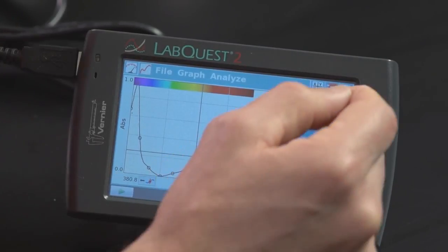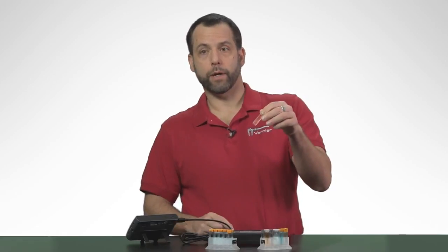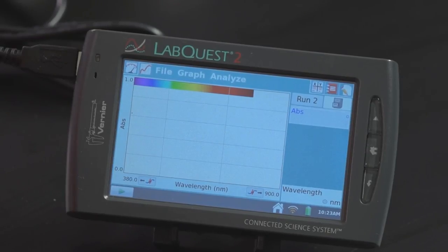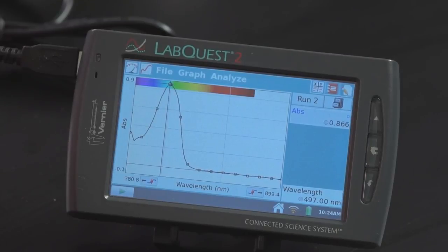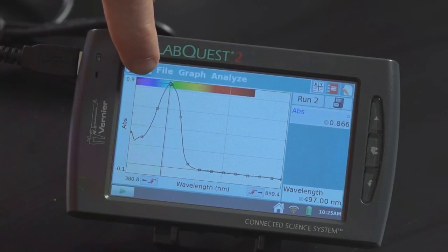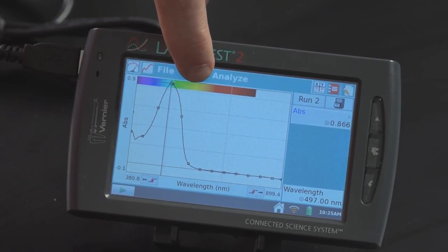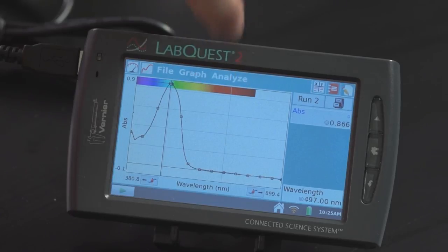If I wanted to store this run, I could just hit this little store button right here, and then I could look at red food coloring. Red food coloring is probably going to absorb mostly in the green. You can see it absorbs a little bit in the blue, then it increases as we get into the green, and then it begins to decrease across the green, but there's very little absorbance here in the red. That means all of these wavelengths are allowed to pass through the solution — that's why the solution is actually red.